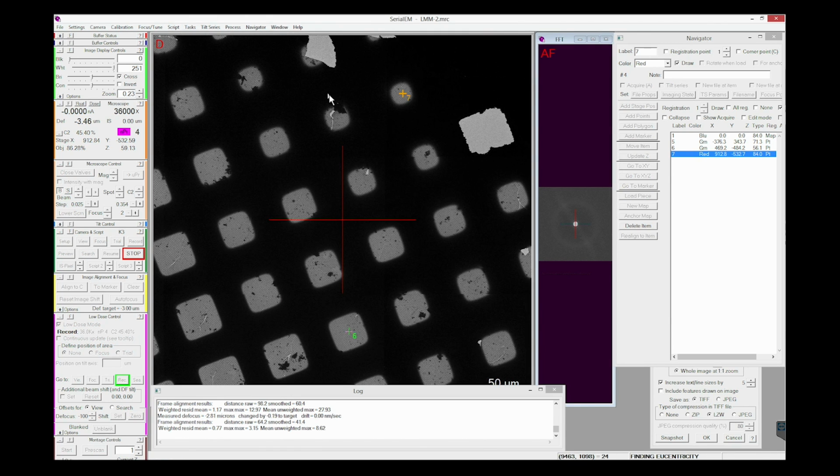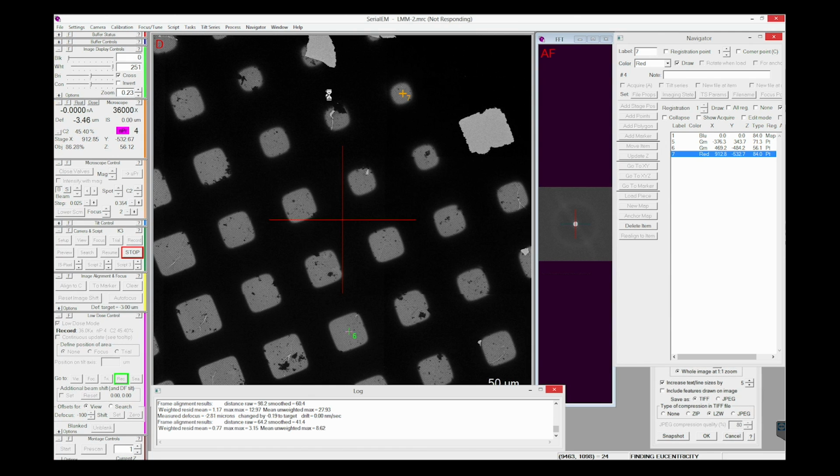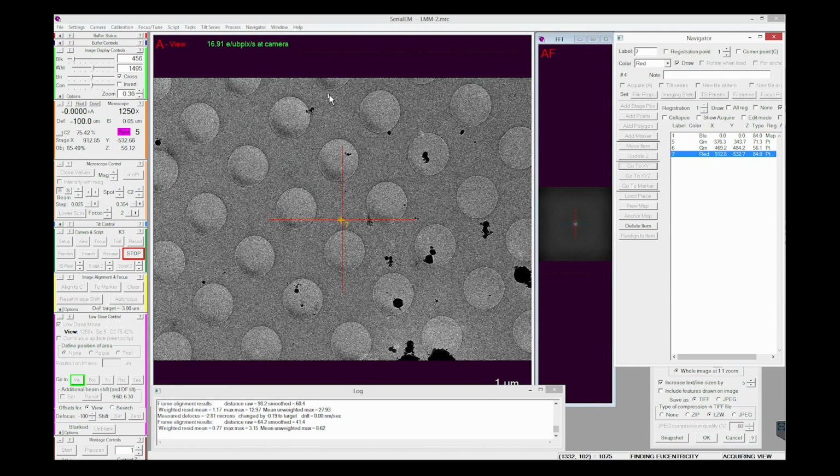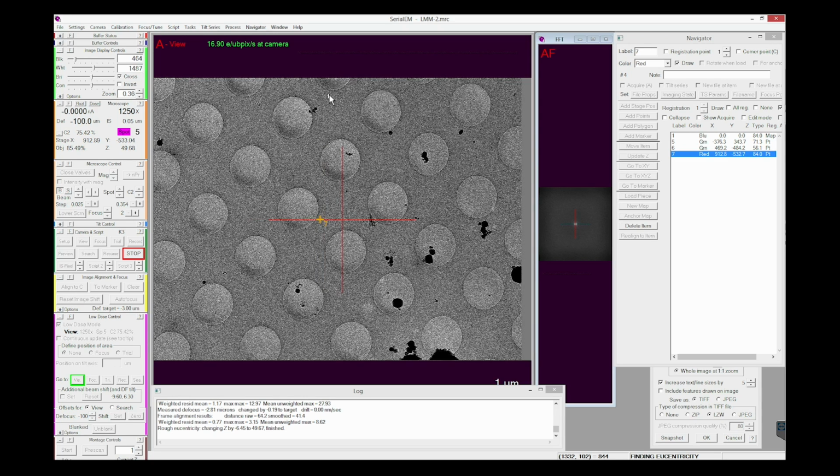Tasks, Eucentric rough. Oh, you can see this one now has different looking holes. You can see a bit of shading, a thicker side to the holes. This is good notes for your notebook in regards to sample quality, or like freezing conditions, starting to learn what occurs.